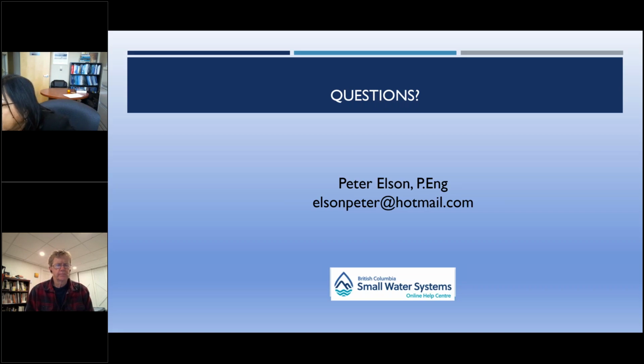Our online milliamp chlorine analyzer does not hold calibration for longer than 8 hours. We use our HACH chlorometer to rely on an accurate measurement. Does iron and manganese interfere with calibration? I think it does. I've not used these online chlorine meters myself very often. Generally speaking, I found they were more trouble than they were worth, but they have been getting better from what people tell me, and some people are very happy to have them.